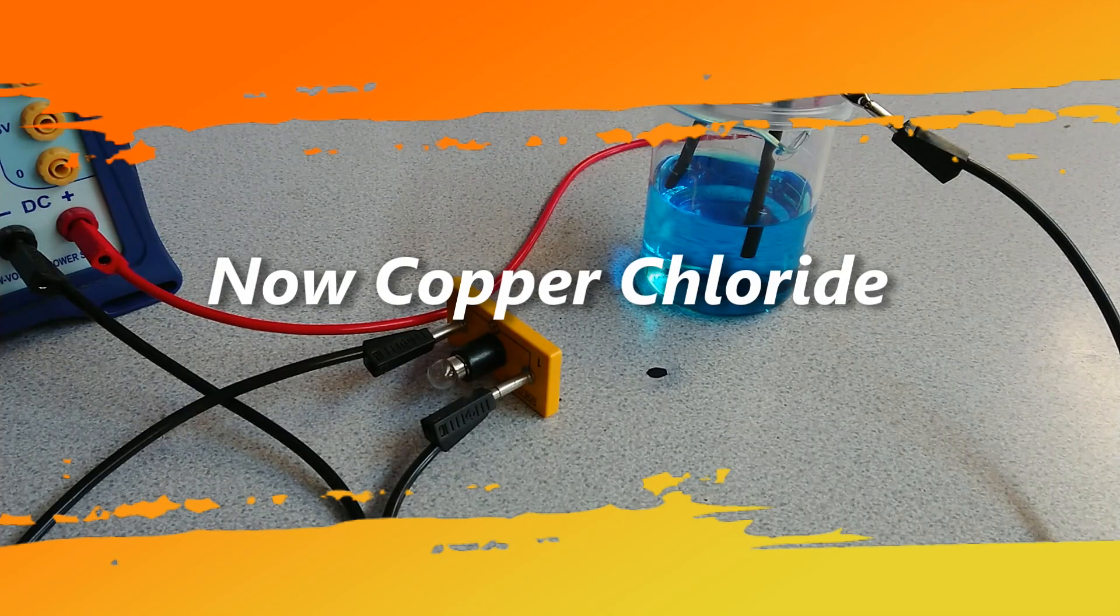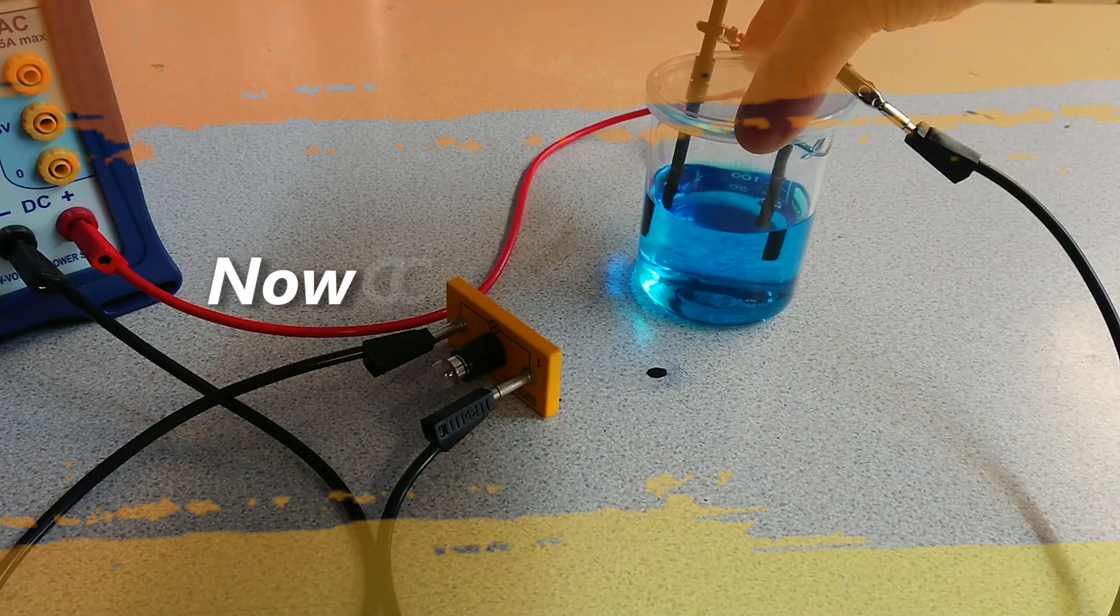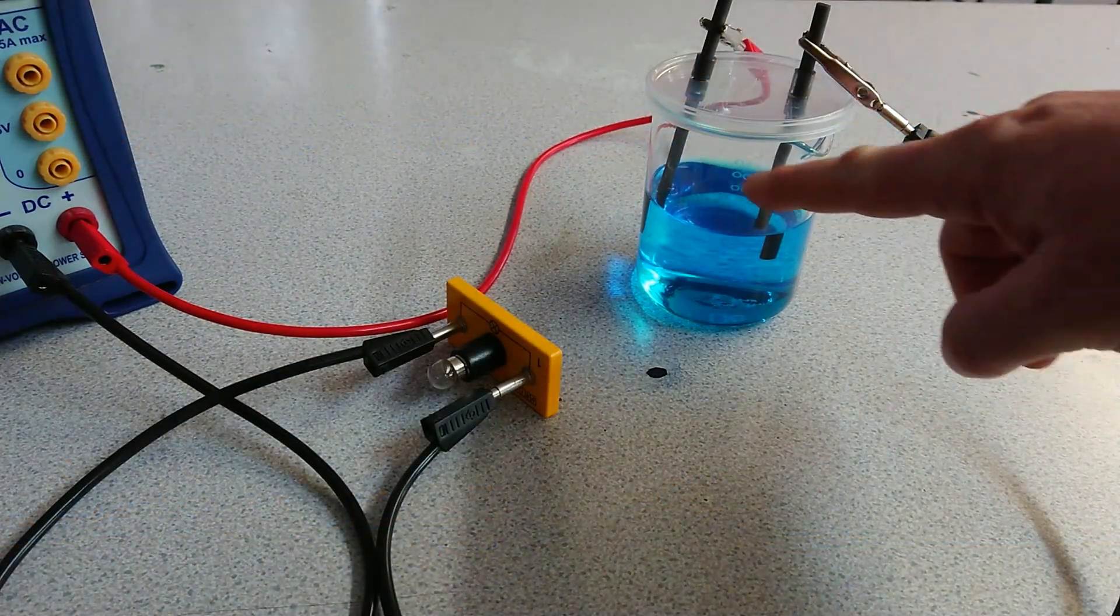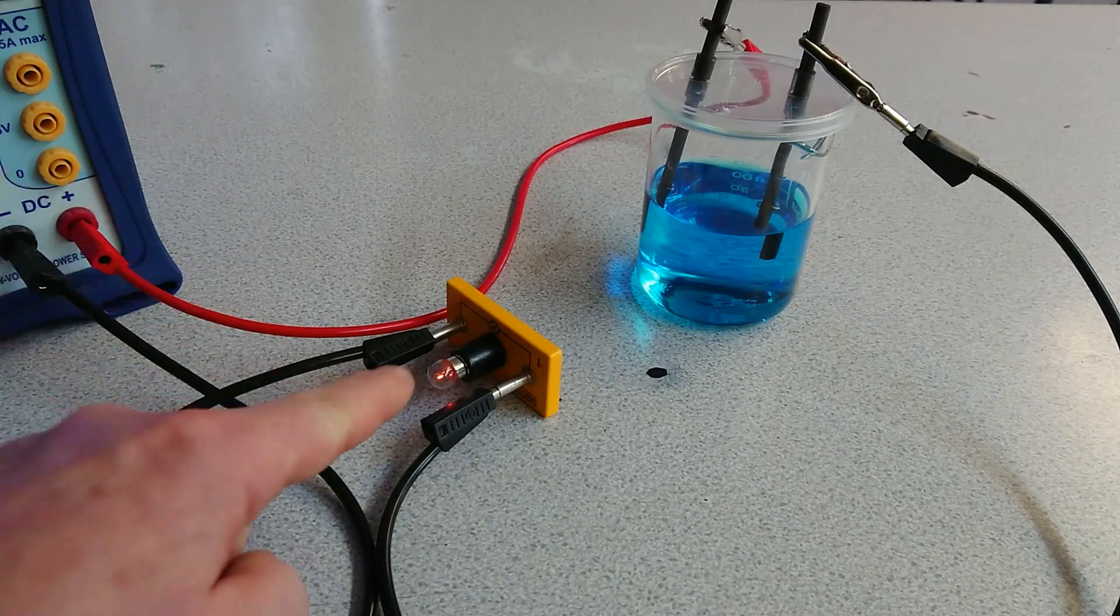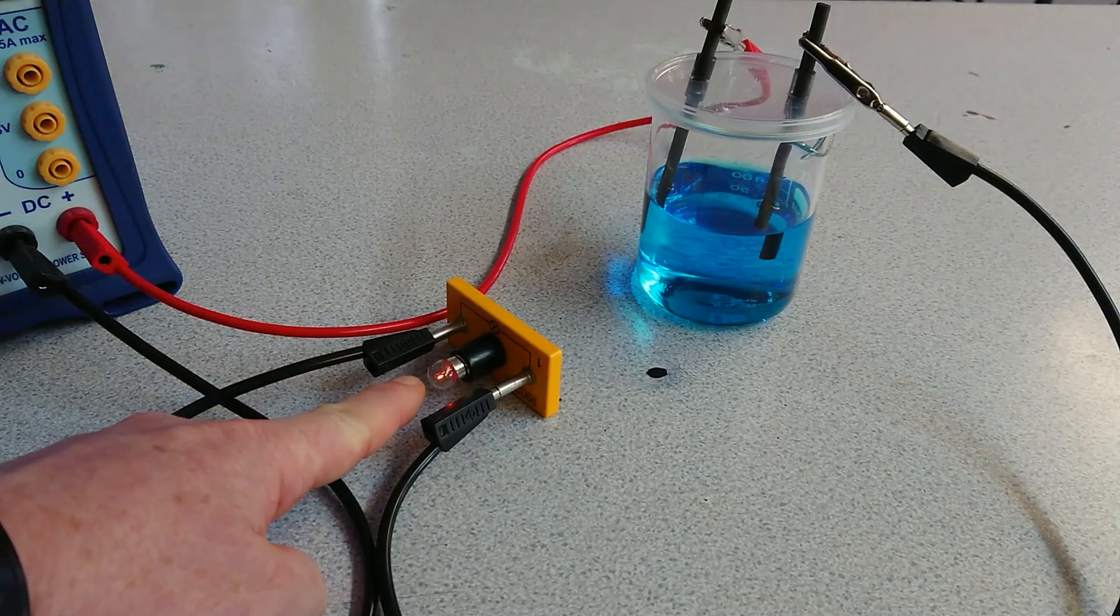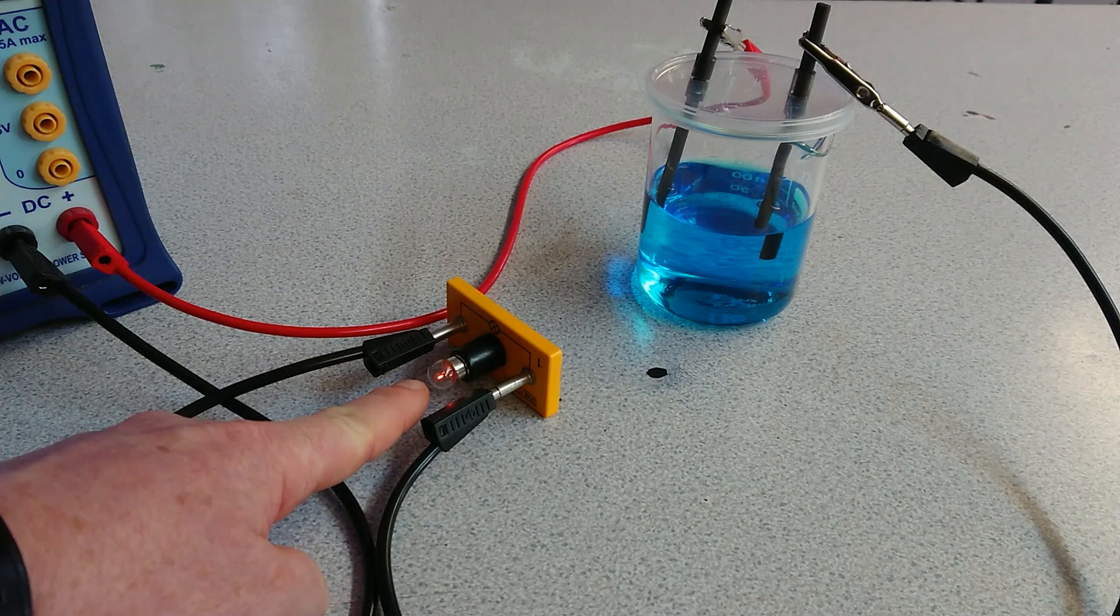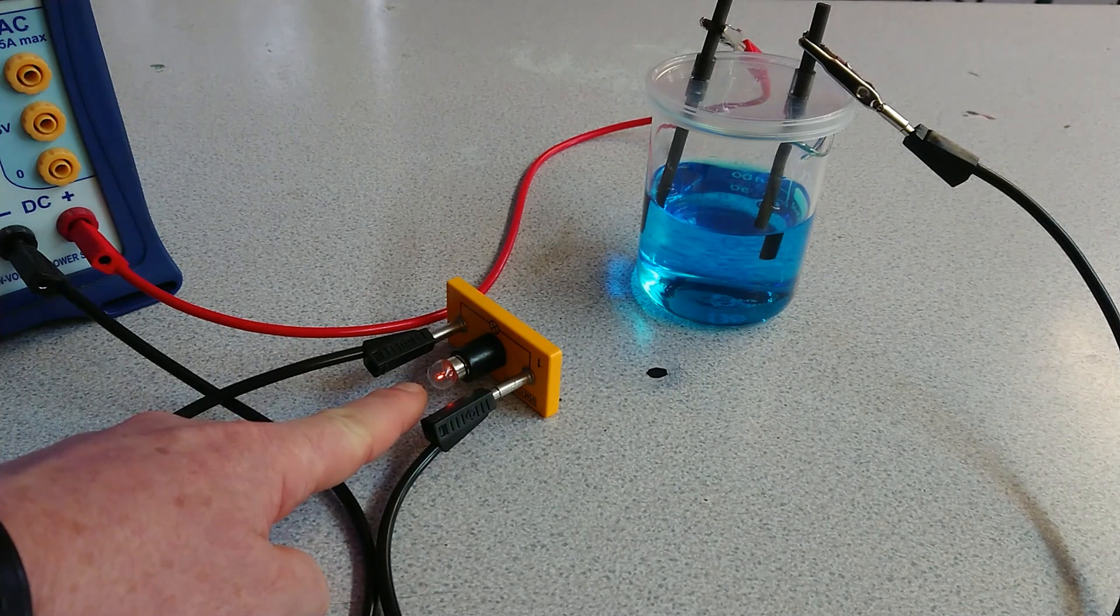We've now added our copper chloride solution into the beaker. We can see that the electrodes aren't touching; they're well apart from each other. If we turn the power supply on now, we can see that we've got a small current flow as signified by the lamp coming on.